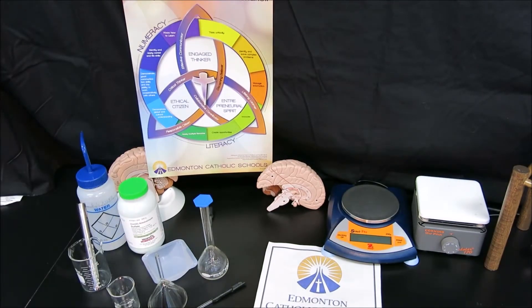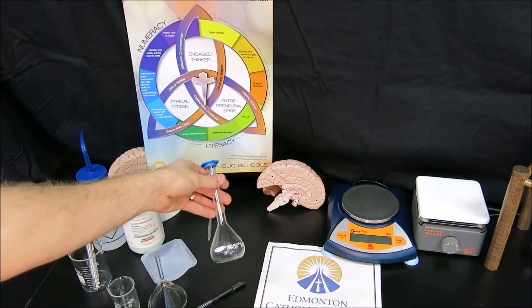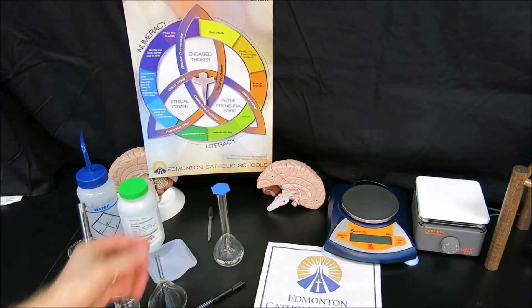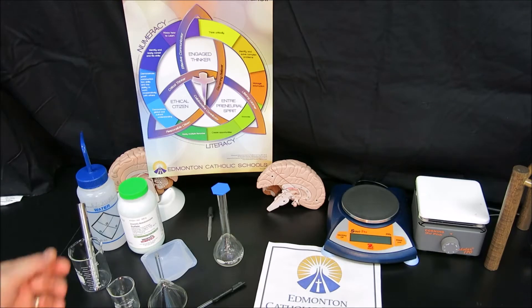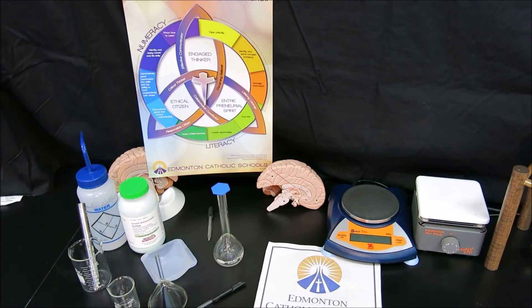In order to make a standard solution, we have to measure the solid from scratch. In this experiment, we're using a 100 milliliter volumetric flask, and our primary standard has been calculated using mole calculations based on the concentration we want in this flask. Our calculated mass today will be 1.00 grams, and we'll weigh that out on the scale.